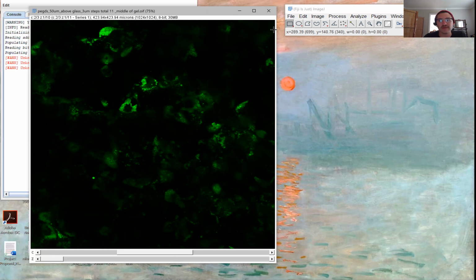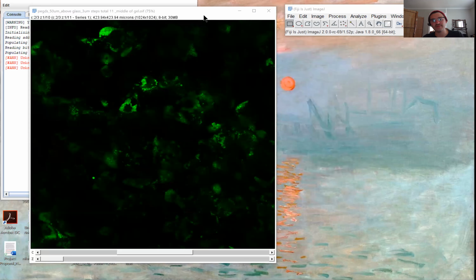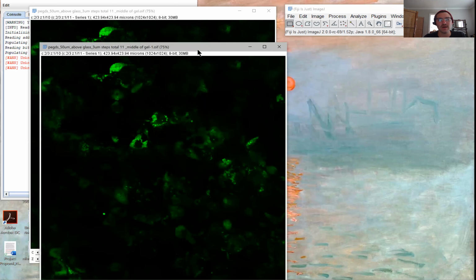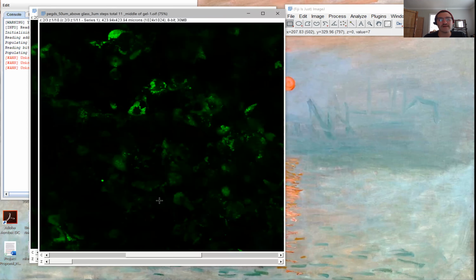And then the last one is how to save it once you're finally done. This is actually my original file, so I will not press save. But say I duplicate it and want to manipulate it later with the same type of functions that belong with this file type.